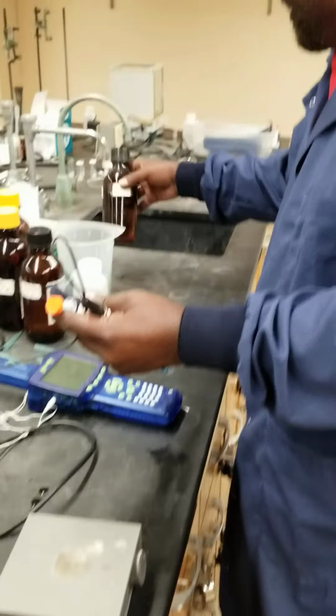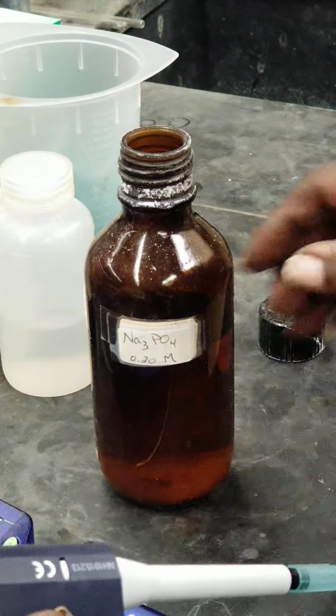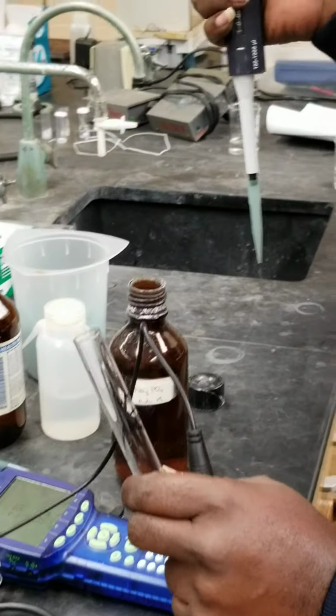Bring in my sodium phosphate. So that's H1 to no H. All right. Weak acid, conjugate base.